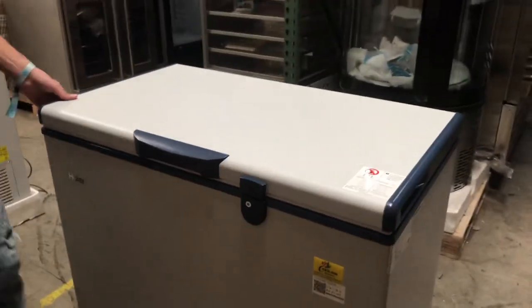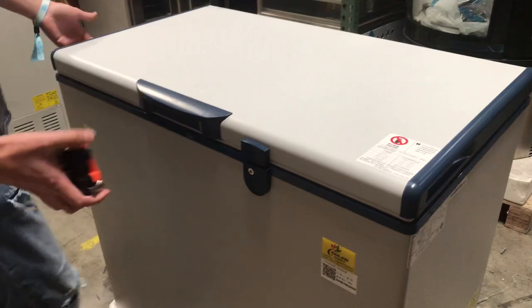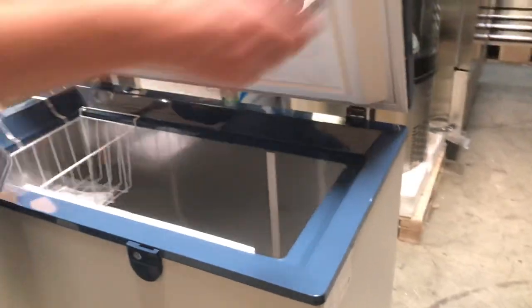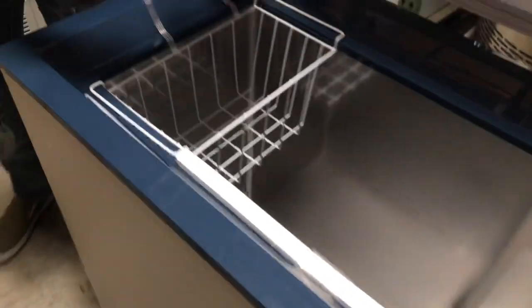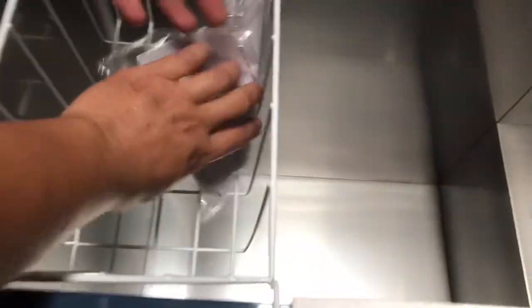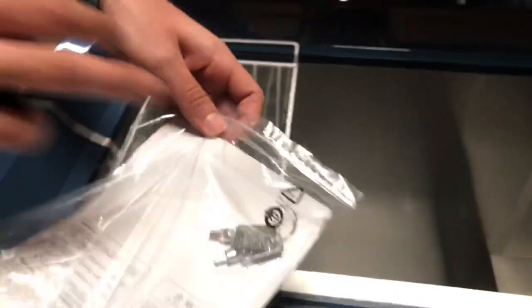Now let's go ahead and open up the inside. It has a handle on the front and handles on both sides. It's going to have a little basket right here. I also have the instruction book with keys as well. You can lock this — you have the option of locking it, and keys will be included.